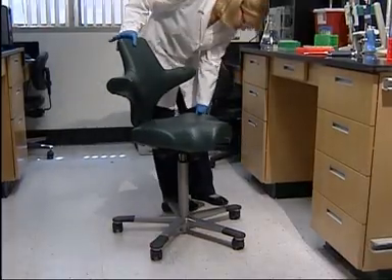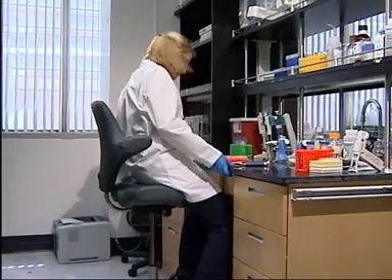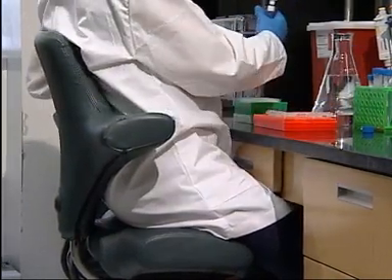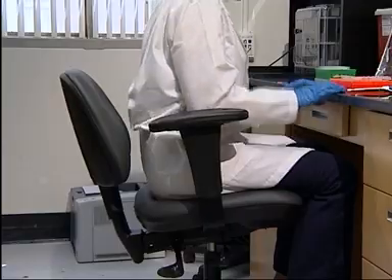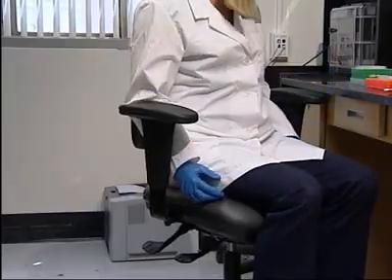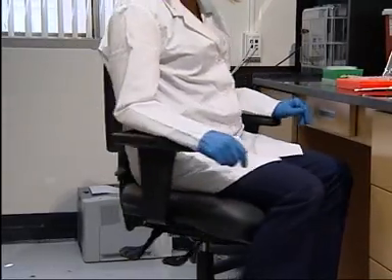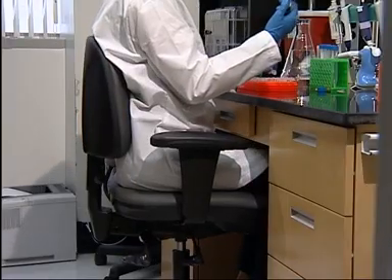If you cannot adjust your bench height, consider using a chair that you can adjust. Set the height of your chair so that the bench is at or below elbow height. Use a foot ring or foot rest to support your feet. Then push your hips back so they are as far back as possible in the chair. Your back should make good contact with the back of the chair. If you lean forward to reach the bench, adjust the angle of the backrest to provide back support. Supporting the middle part of your back is important if you do a lot of leaning and reaching. If you have armrests, adjust the height so your arms are supported and your shoulders relaxed. Adjust the armrests to just below the level of your forearms. If your armrests cannot be adjusted and interfere with your work, consider removing them.